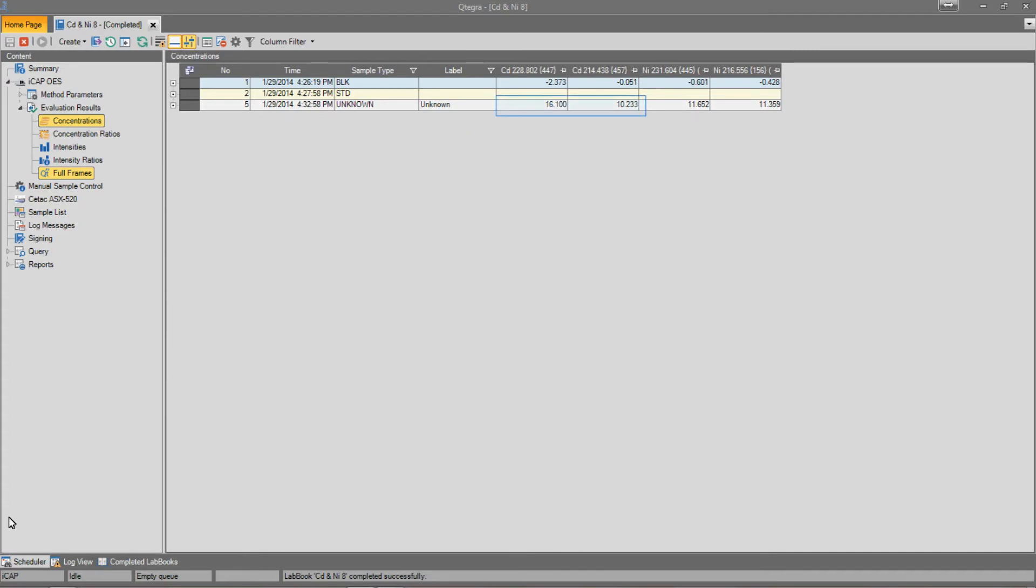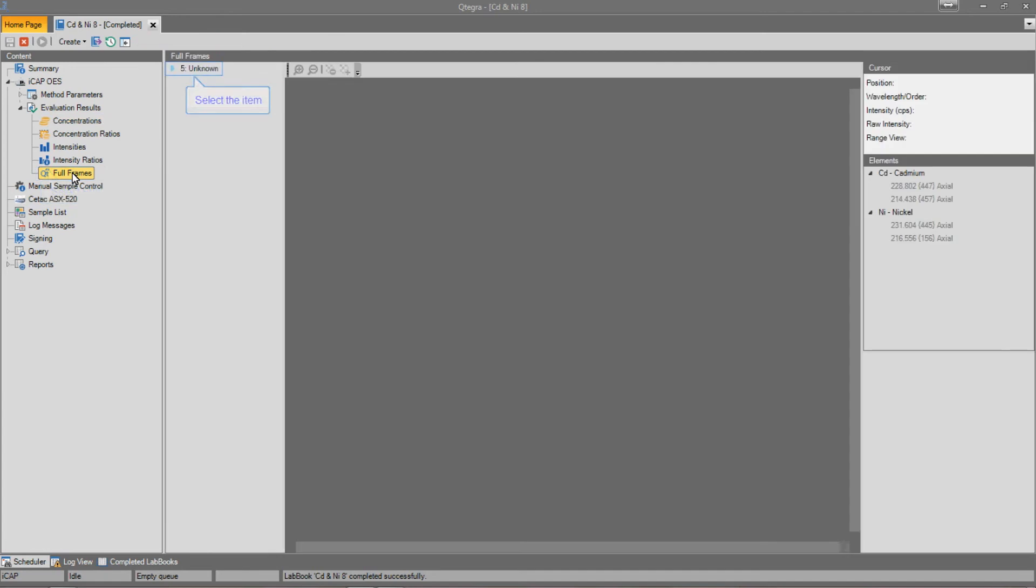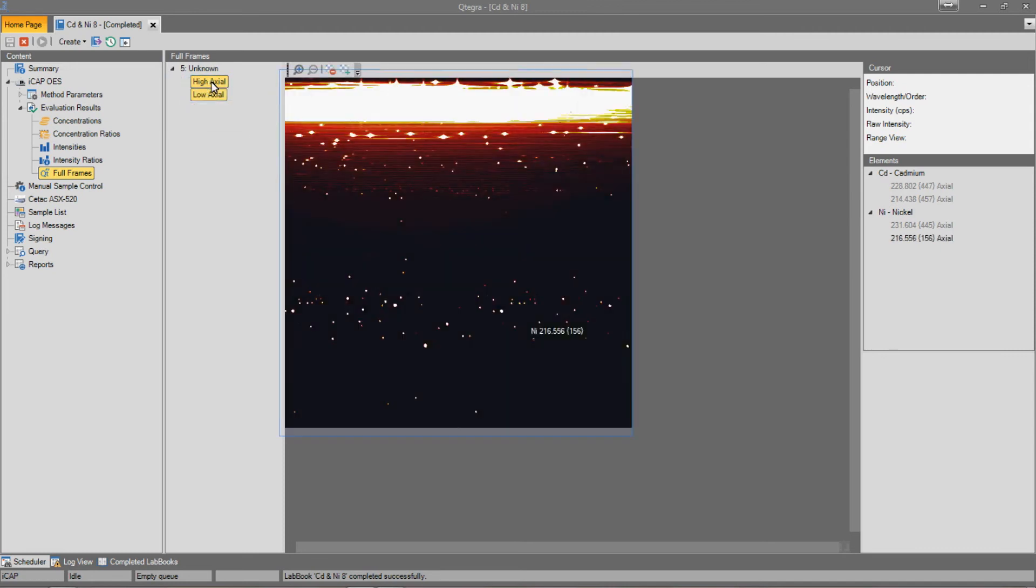Now that our analysis is complete, we can see that the unknown sample appears to have an interference on the cadmium 228.802 nm line. So let's move to the full-frame page. If we open up our unknown sample, we can see that we get a full-frame image for each of the views that were selected in the measure modes.